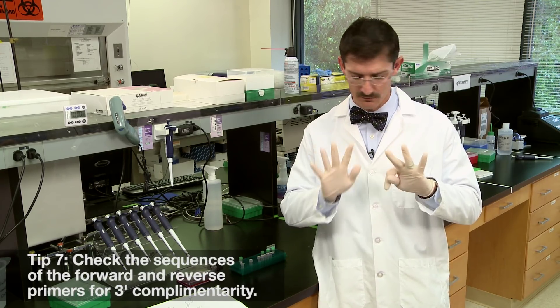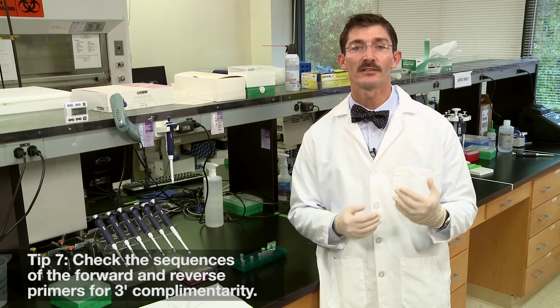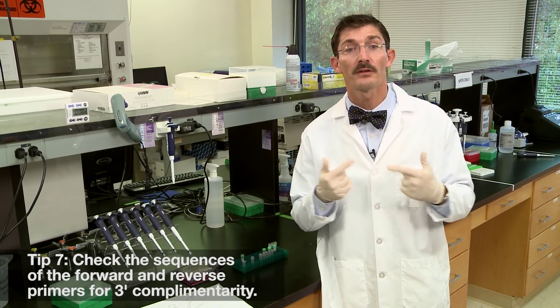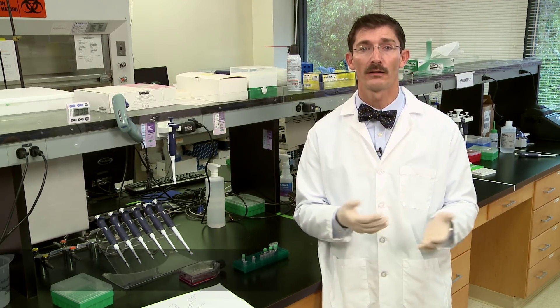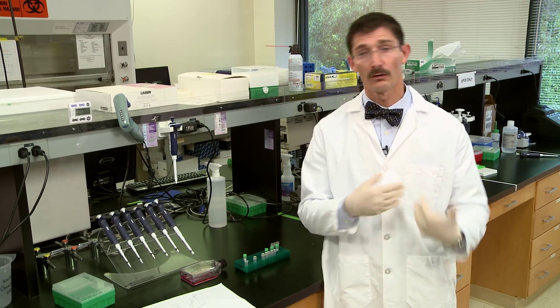Number seven: check the sequences of the forward and reverse primers to ensure that there's no 3-prime complementarity. This could actually lead to primer dimer formation. And the final tip: verify your specificity. Use Primer-BLAST or any other software of your choice to check your genome of interest. You really don't want to be amplifying multiple sequences in Arabidopsis or anything like that.